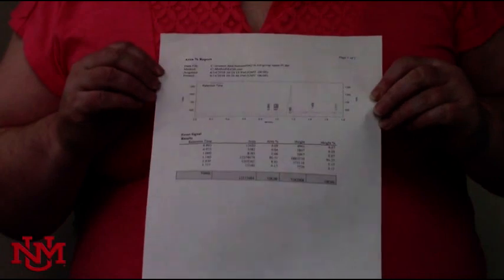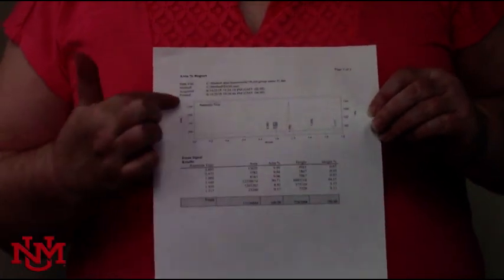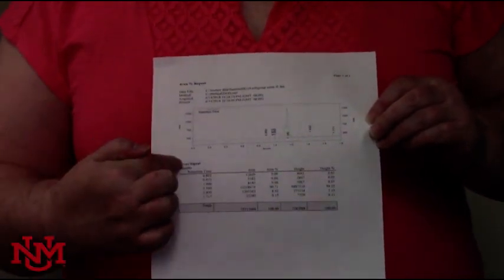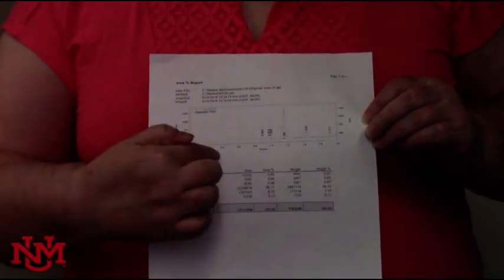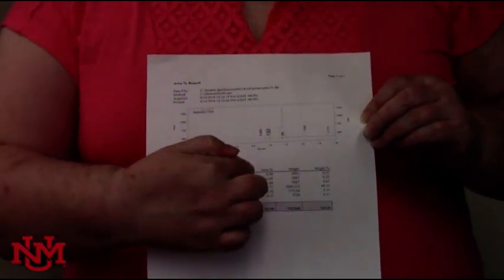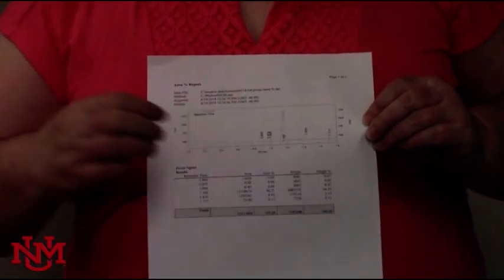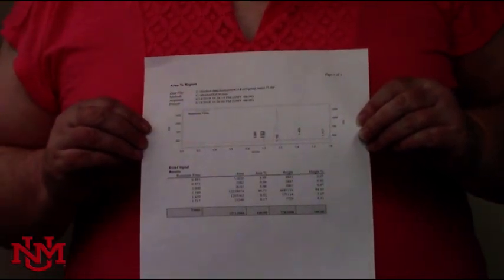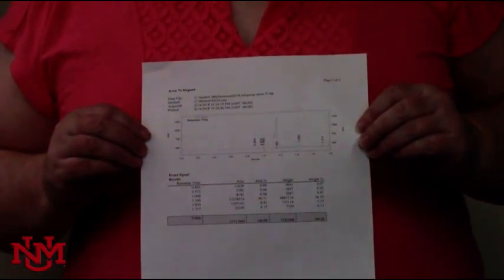All right, when you get your print out, you'll see you have your chromatogram, your retention time, area, area percent, height and height percent, which you'll use to answer the post lab questions.